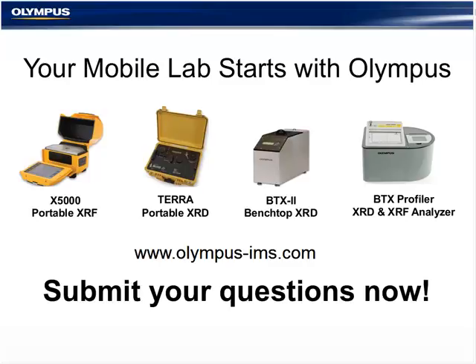Just as a follow-up from me on this subject, Dawn, how long does the whole sample prep take from shaker to instrument? If you have it down to a systematic approach, without much effort or killing yourself, it's pretty easy to collect, clean, dry, grind, and run a sample and get results in 30 minutes.